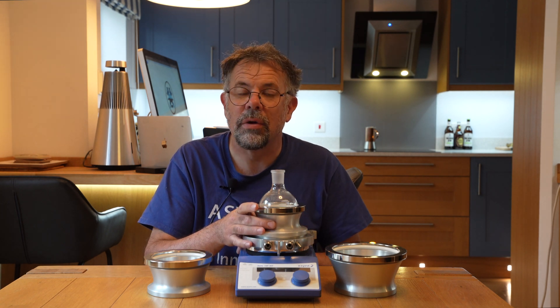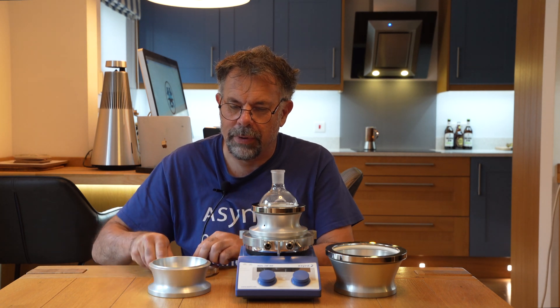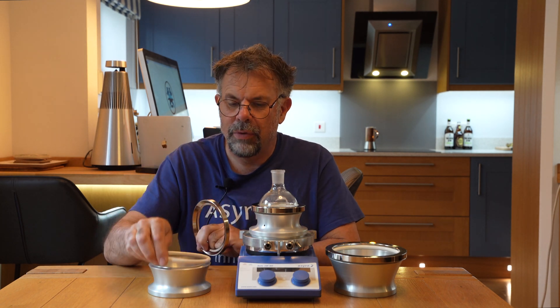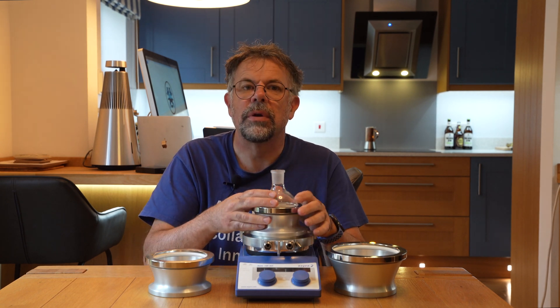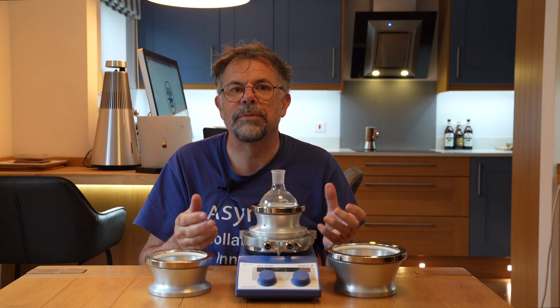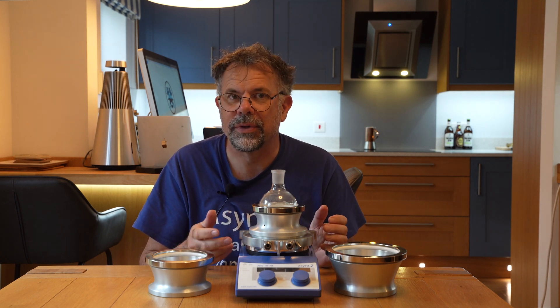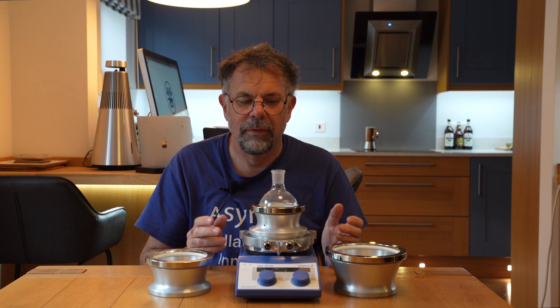A key feature of Snowstorm 1 is that, unlike the heating-only DrySyn blocks, we have an O-ring seal and weight — a very simple mechanism that keeps the flask sealed and airtight underneath. That's quite important because if you were to get condensation moving under the flask and then freezing, ice expands and could potentially crack the flask. So this prevents moisture from getting under the flask and prevents any potential cracking issues.